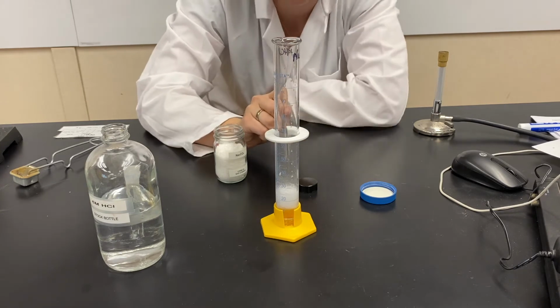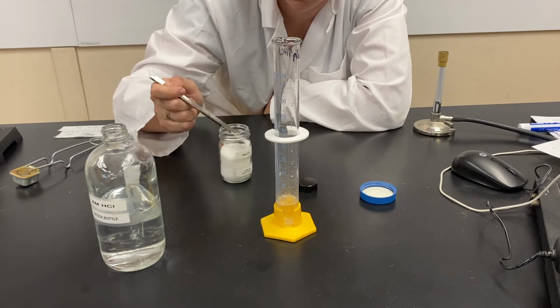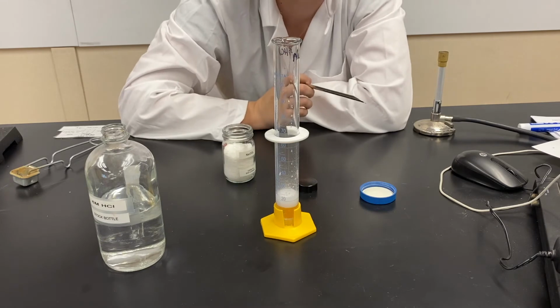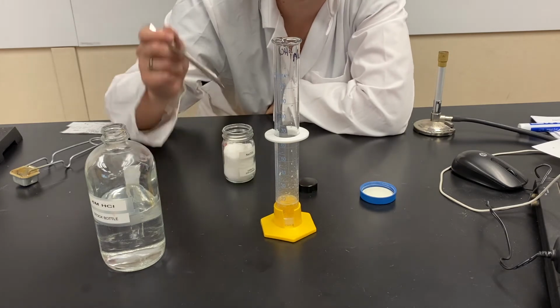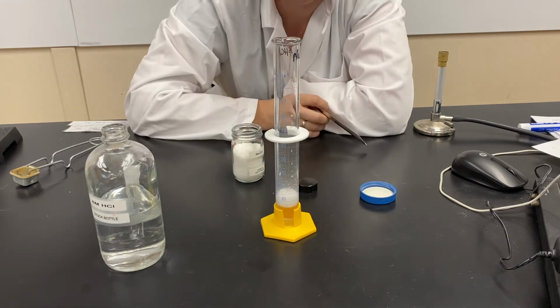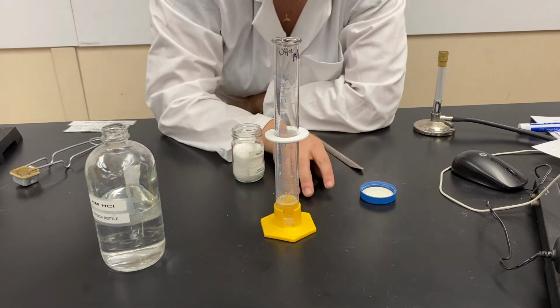Okay, we see bubbles right away. Very exciting. They die down if I add a little more. See if it reacts more. Yep. Okay, so I'm creating some kind of gas. I see bubbles. Right, that's one of the clearest ways to know that a chemical reaction is taking place. You see bubbles, you know some kind of reaction's happening. This is a double replacement reaction. Very exciting.